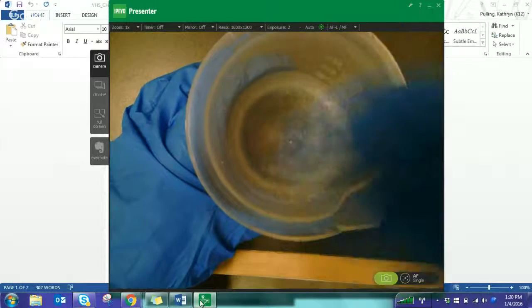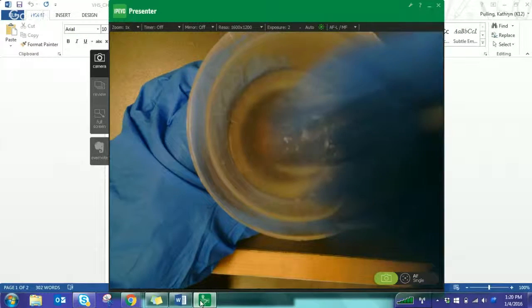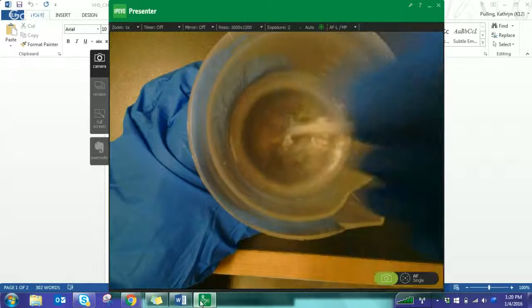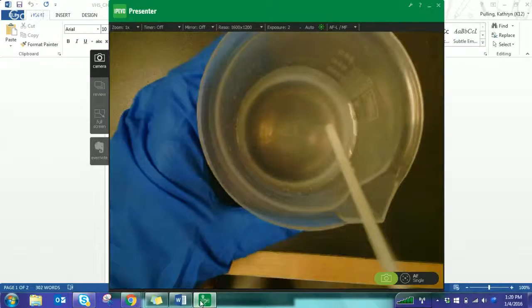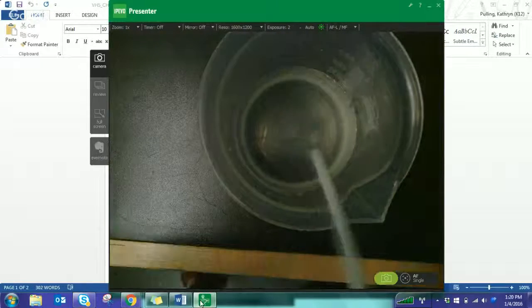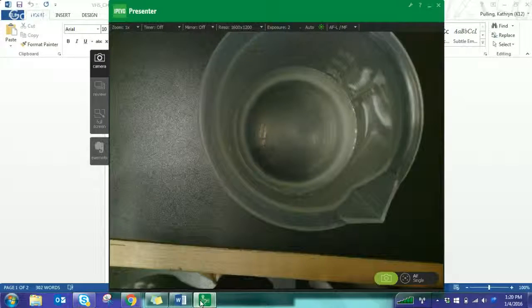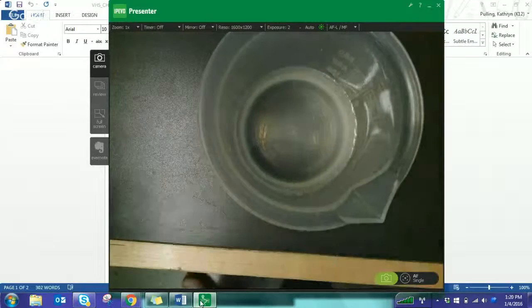So, did the alum disappear? What kind of change is this? Do some review back to Unit 1. Dissolving means that the ions have separated and they are being pulled apart, with a water molecule in between each of the ions. So you actually haven't lost any of the solid. It's just broken up so tiny that we can't see it. If I were to allow this to evaporate overnight, and evaporation is a physical change, we would get that alum back. So this was a physical change.